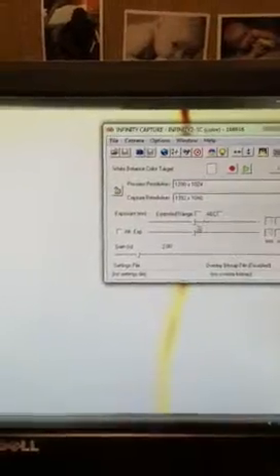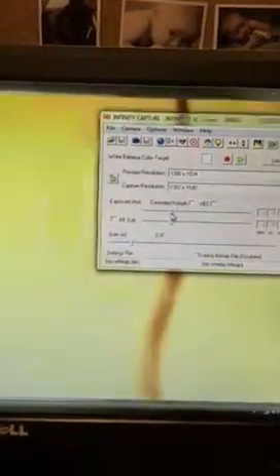I can also change the resolution. There's a monochrome option, where it is in black and white. There's also various resolutions that you can choose from in color.